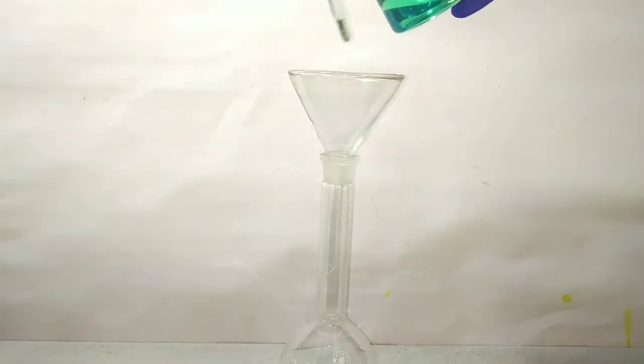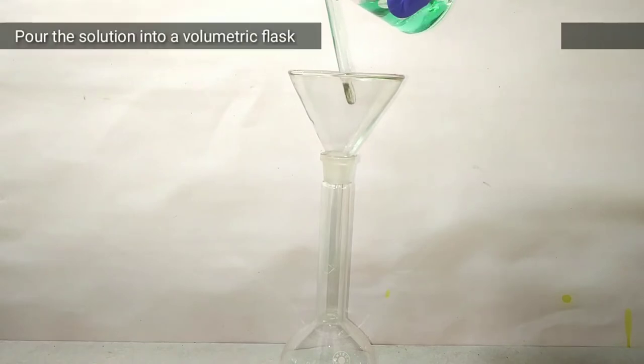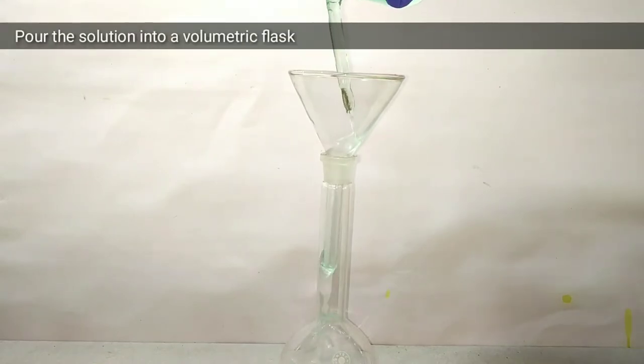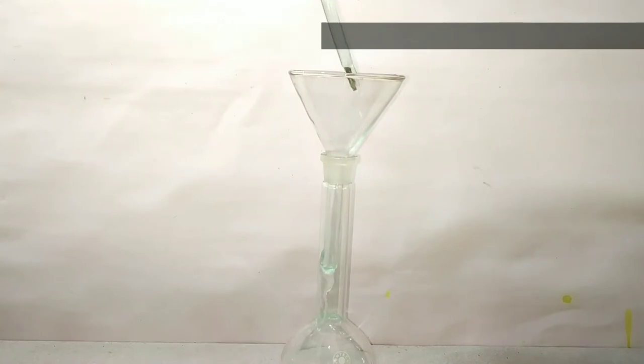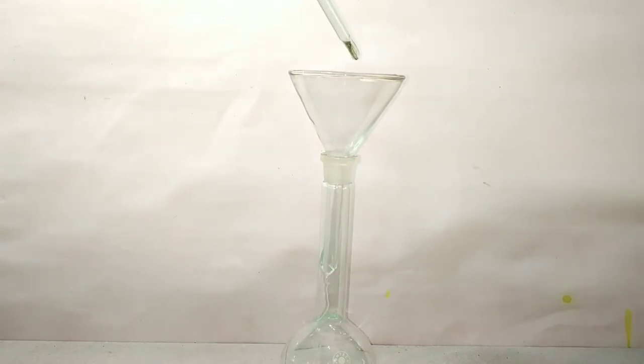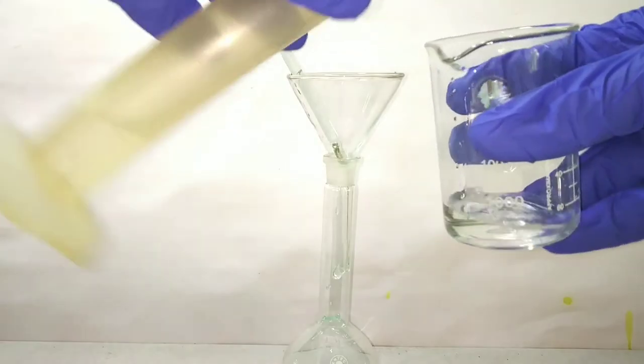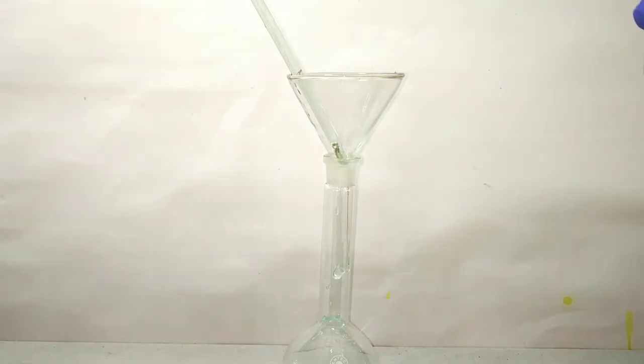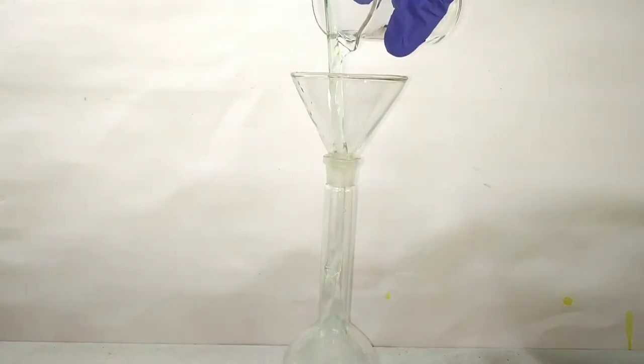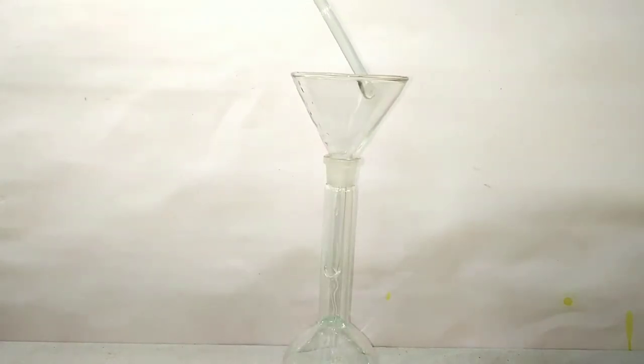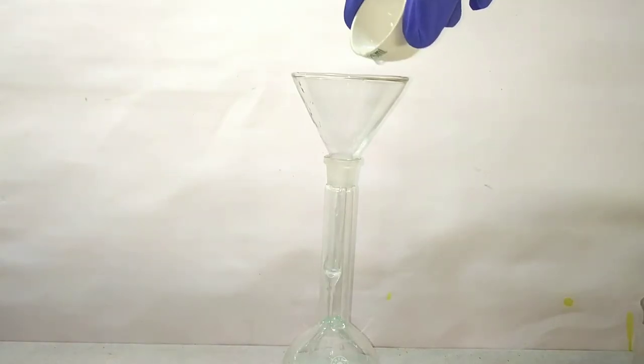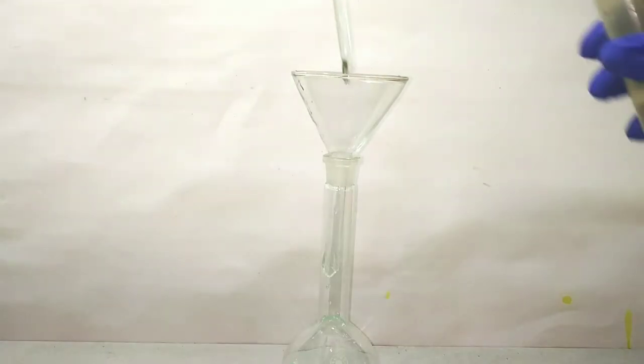Now we transfer this solution into a volumetric flask with the help of a funnel and glass rod. After transferring, wash the beaker with some distilled water, and the dish in which we had collected the solution, we also wash that with distilled water. Finally, we will wash the glass rod with which we transferred the solution.